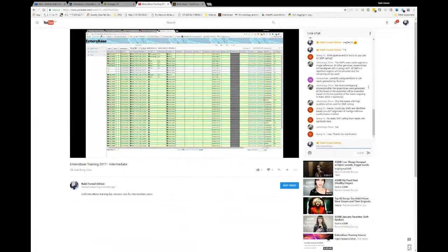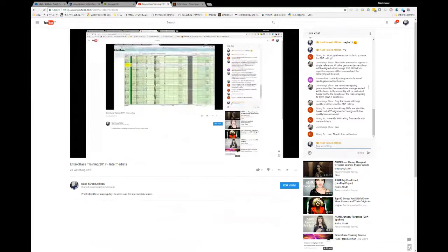We do check the base quality of the assembly by mapping the reads back onto the assembly after it's done, for each genome that is processed by EnteroBase. And you can download a FASTQ file that shows you the quality scores for each base. I'm showing that in a minute. Oh, you're showing that in a minute. Okay. And yeah, that's it for that. So I'll jump back to you.